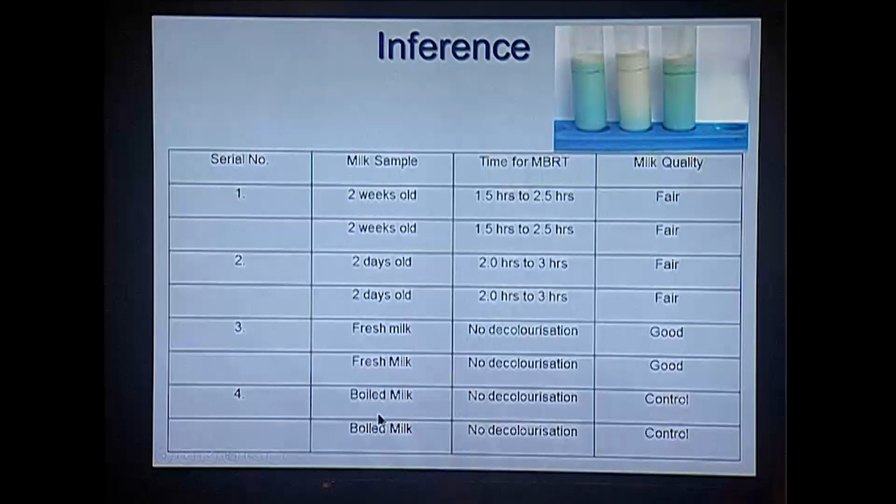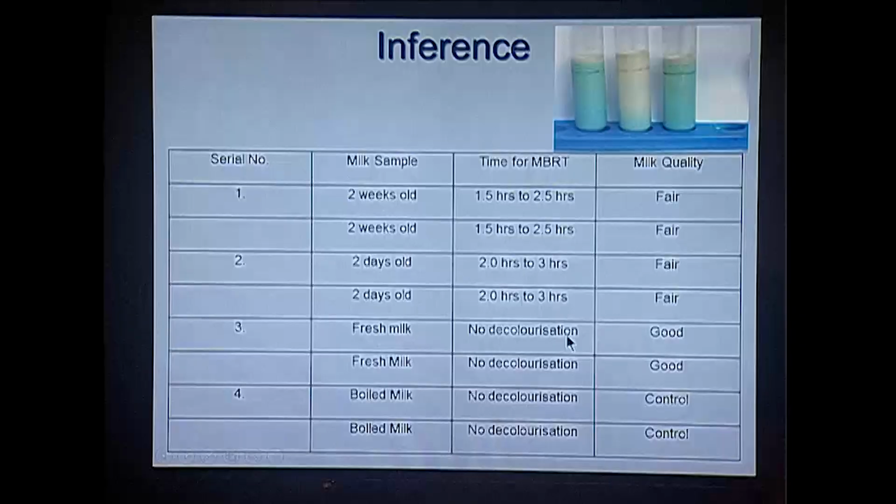Since we are heating the milk, the microbes are killed. As a result, there will be no microbial activities present in this boiled milk. As a result, methylene blue will remain blue in color. So, accordingly, we can see the time which is noted down for the MBRT reaction.